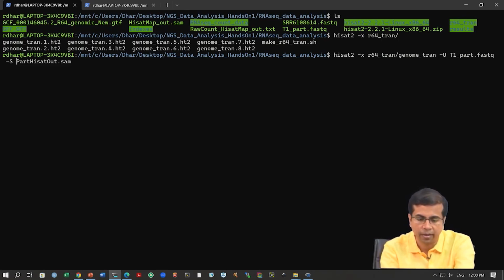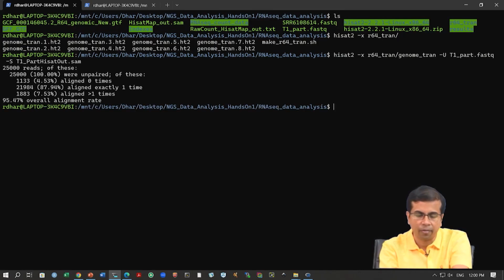Okay, maybe we can just say T1 part, because this is from the T1 part file. All right. So, let us run this and see. Okay. So, what is the output? We have 25,000 reads. These are unpaired reads. Then it gives very similar statistics like before. You can see this, right.